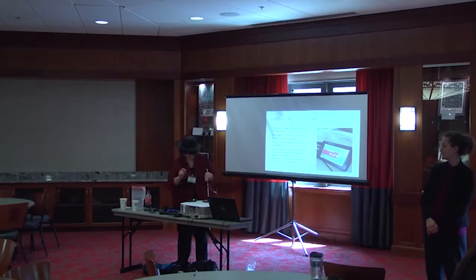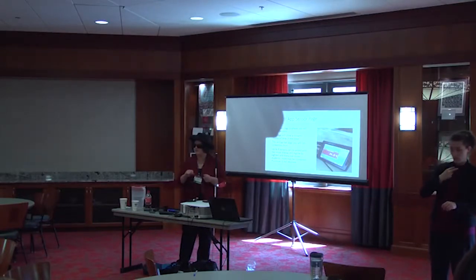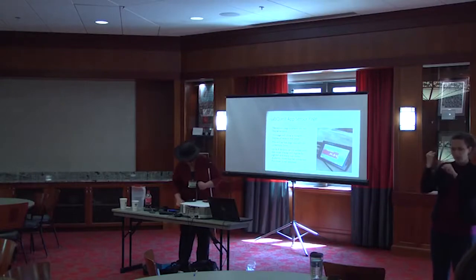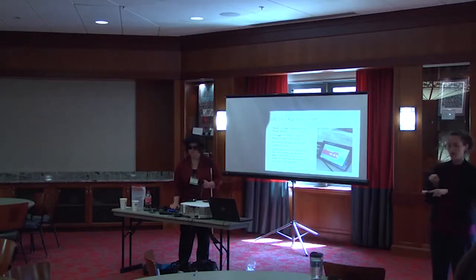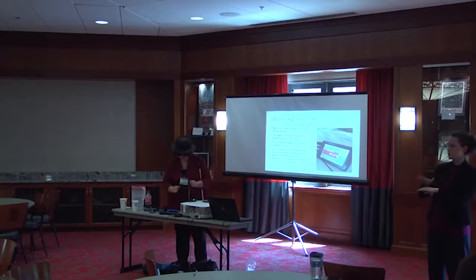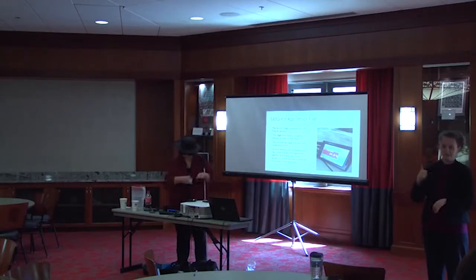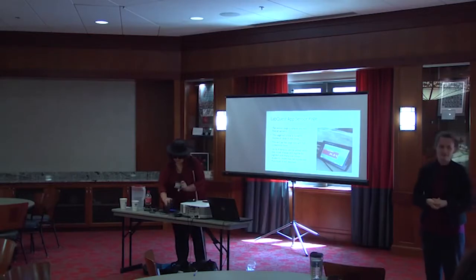Then we have live tone play, which is one of our newer features. So if we go back to the main desktop, LabQuest application. Notes page. And then Menu. File. Menu. Notes. Menu. File. Let's see here. Text box length. I don't want that. Come on.